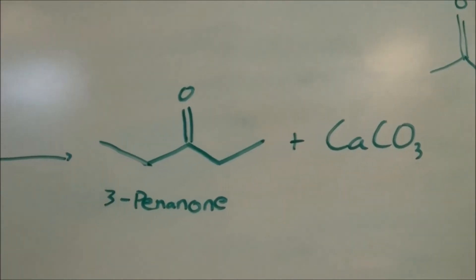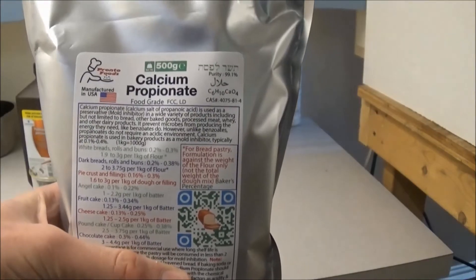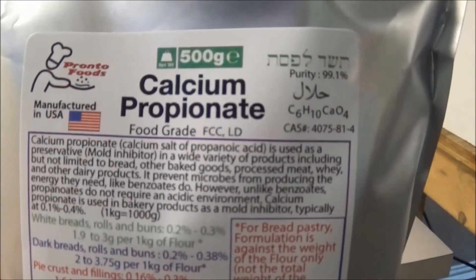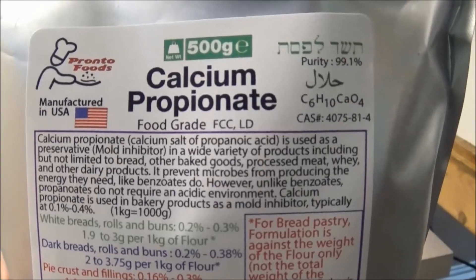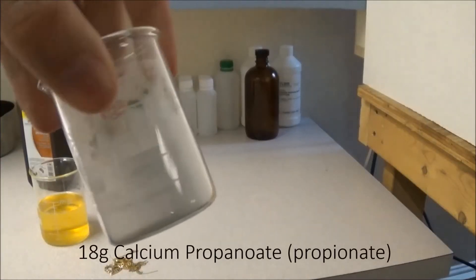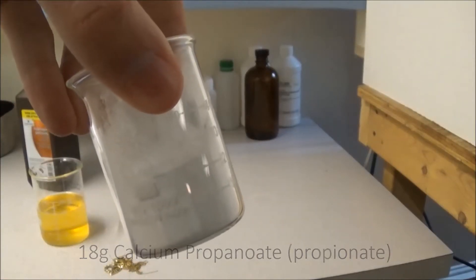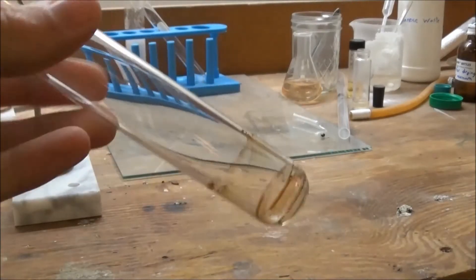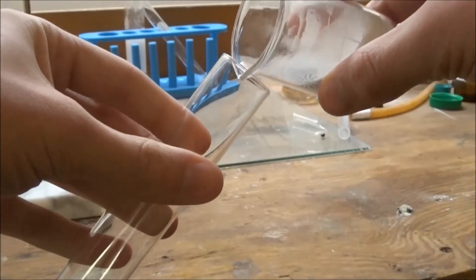I bought my calcium propanoate online as a food preservative. It is used to preserve bread. I weighed out around 18 grams and proceeded to add this to a large 50 milliliter test tube. I did this because I didn't want to damage any of my nice flasks.